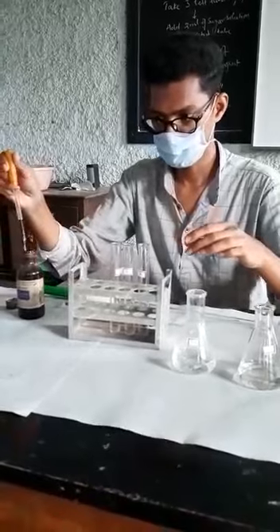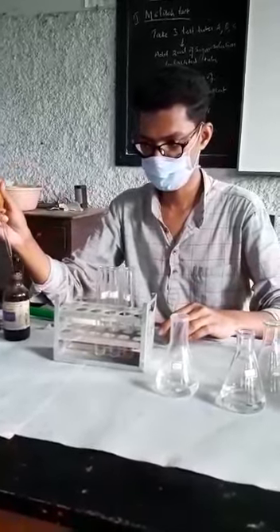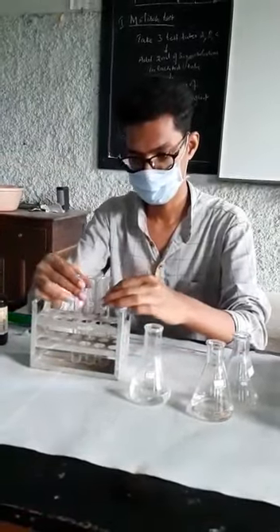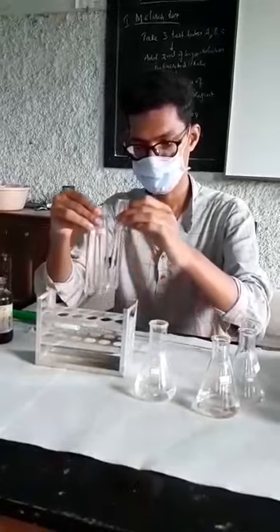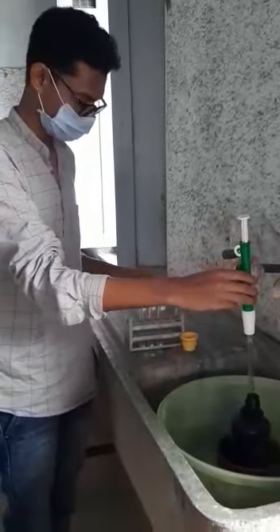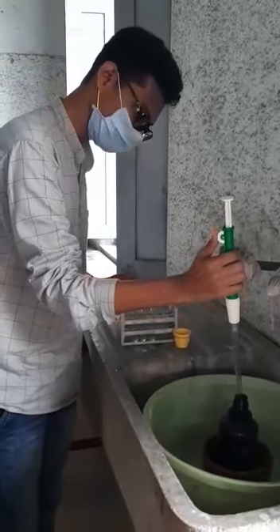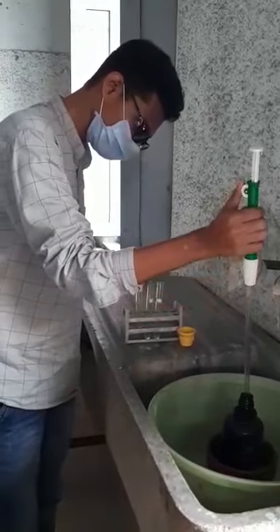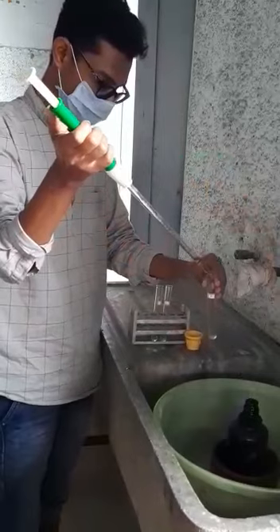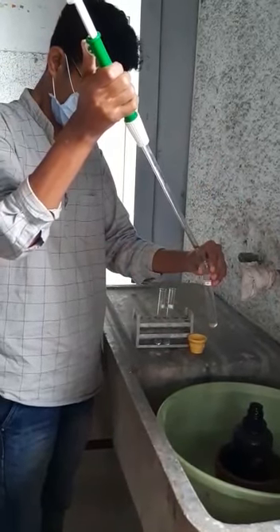After adding a few drops of Molisch reagent in each test tube, now he will add concentrated sulfuric acid, 3 ml in each test tube. We will go to the acid. Now Mr. Varun is pipetting out 3 ml of concentrated sulfuric acid and adding it to the samples. See that it is not falling on your hands.